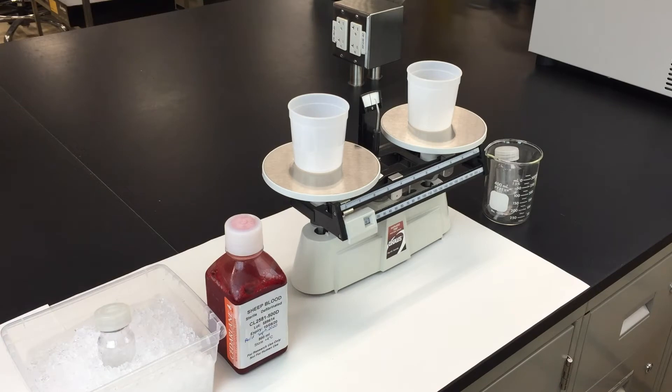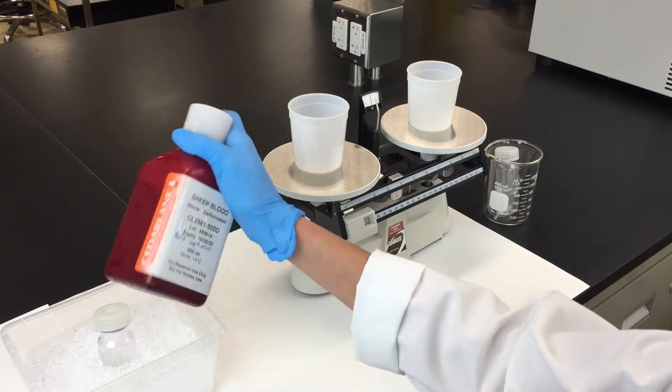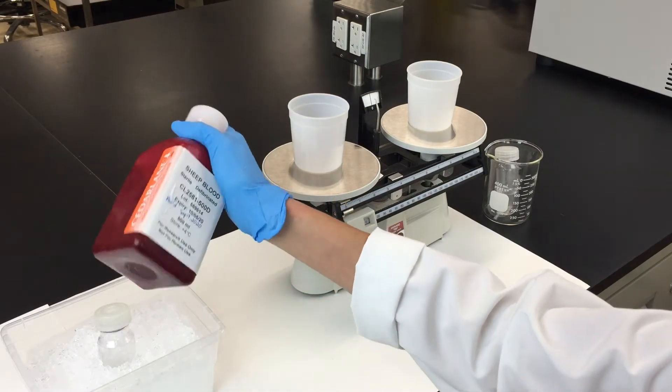For this experiment, the hemolysate has already been prepared for you, but it's important that you know how it's made. We'll start with a bottle of defibrinated, sterile sheep's blood. Take the bottle and invert it several times to re-suspend the red blood cells.